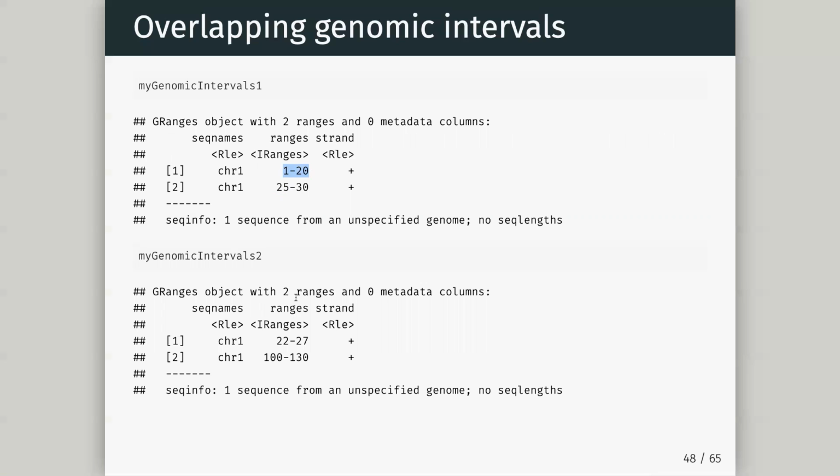Then we don't know what regions it's overlapped with, but we could use this, say, if this was our TSS sites for genes and we just wanted to know which ones overlapped our ChIP-seq mark, we just want the true or false. We don't care about it.